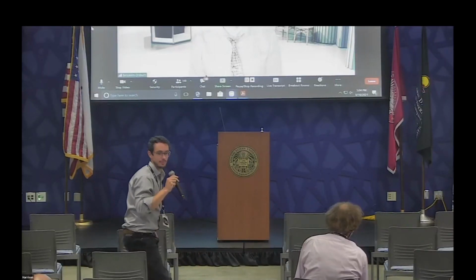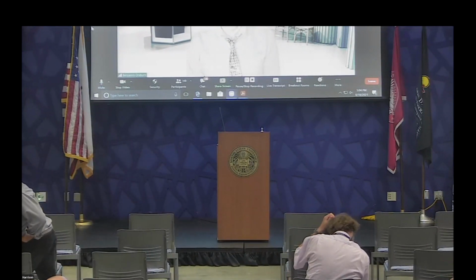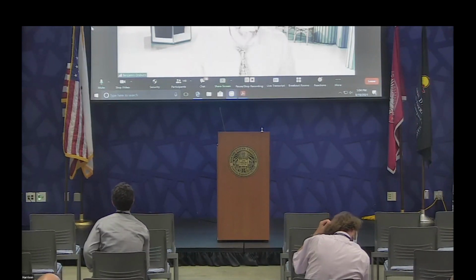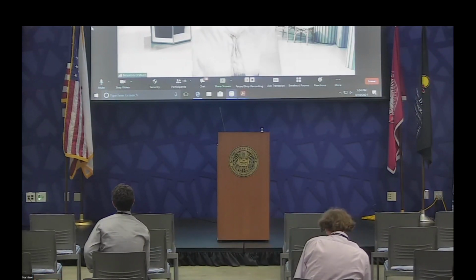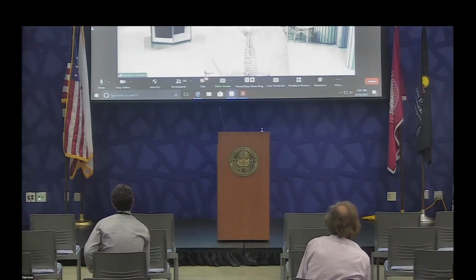Any other questions? Hey, Ben, it's John. I don't know if you can see me, but thank you for a wonderful talk. Just as an overview to your energy field talk, do you think that an Orbitrap and a Bruker timsTOF are going to be able to provide equivalent level performance, or do you think that in the end, one of those technologies is going to end up being more useful for very low sample amounts?